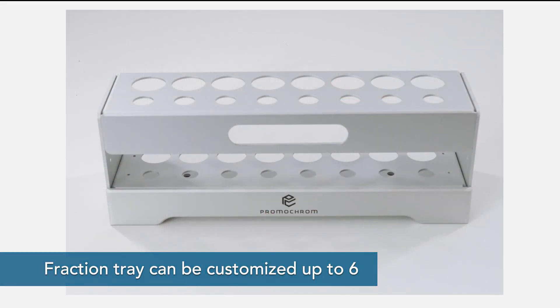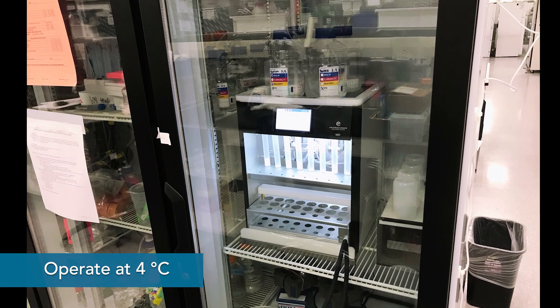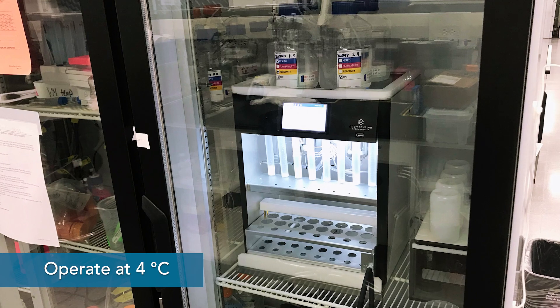Two fractions can be collected by default, but can be customized for up to 6. The compact design even allows the AutoPure to be placed in a fridge to operate at low temperatures.